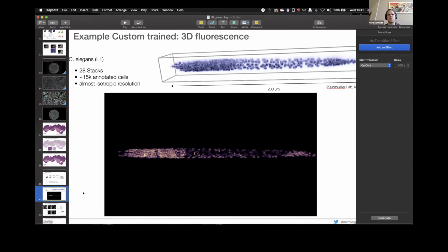Okay. But in 3D, the points change every time, right? If you increase the number of points, you get different positions. Yeah, that's what I mean. In 2D, you always keep the points from last time and add more, so it shouldn't go down, I think. But in 3D, it can happen through this discretization, so it can fluctuate a little bit. It can fluctuate, but there should not be a 10%, 20% loss of accuracy. No, it's just a little bit.